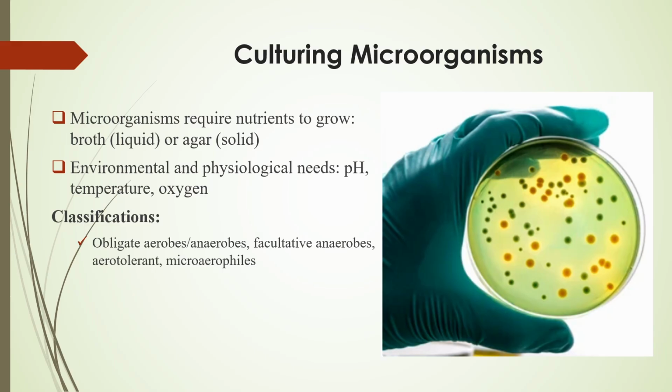Culture media, which might be solid agar or liquid broth, are used to supply nutrients. Agar gives all colonies a surface on which to be observed, whereas broth permits widespread growth. Microbes require particular physiological conditions in addition to nutrients. These include ideal oxygen availability, pH, and temperature. The majority of human infections, for instance, are caused by mesophiles, and they thrive at body temperature.